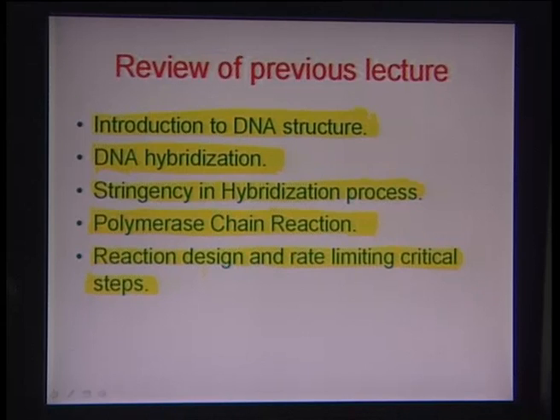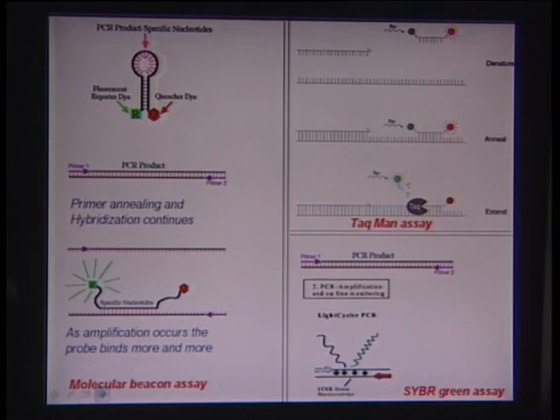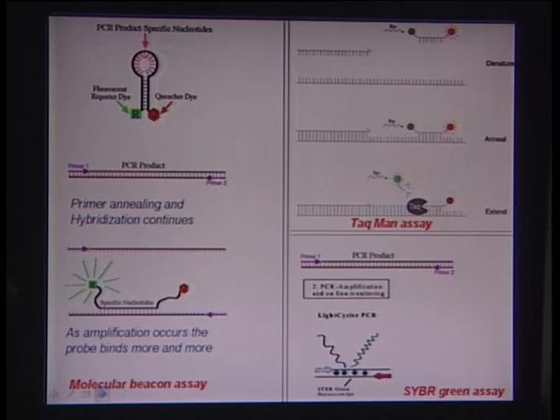Now today, once the DNA has been obtained, we will look at how we obtain information about whether the sequences that we want are being copied or not. In other words, we need a mechanism to detect, on a real-time basis, snapshot by snapshot, the different stages this reaction is in as the DNA copies and becomes multiple folds. Because it is just molecules and they cannot be visualized, we need to rely on spectral information. It could be an absorption spectra, it could be a fluorescence based spectra.